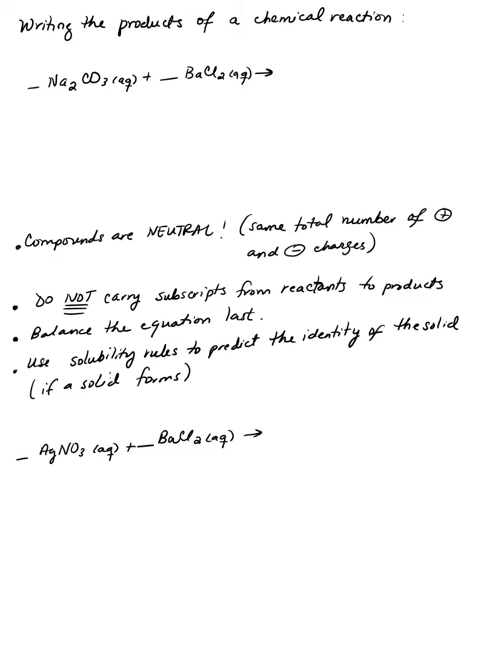If you have formation of a solid, it means that a chemical reaction happened, and the type of chemical reaction that is happening is a precipitation reaction. The solid is precipitating out of your solution. Change in color means that you had a chemical reaction happening.